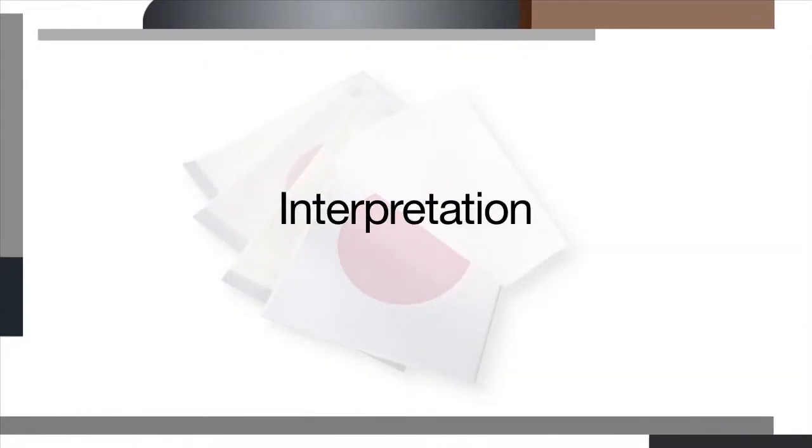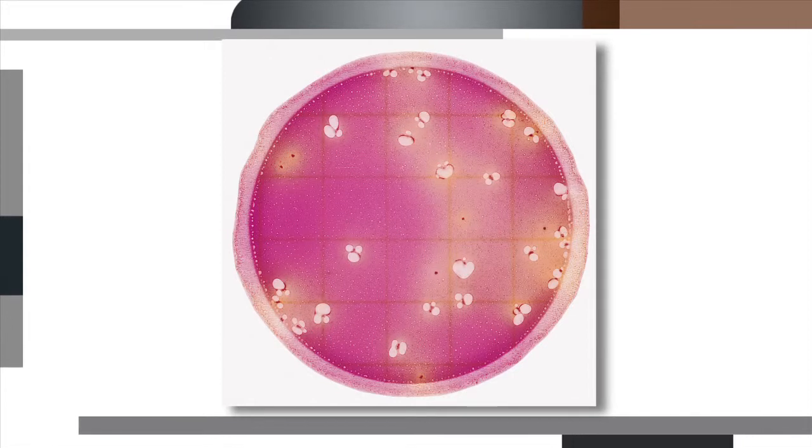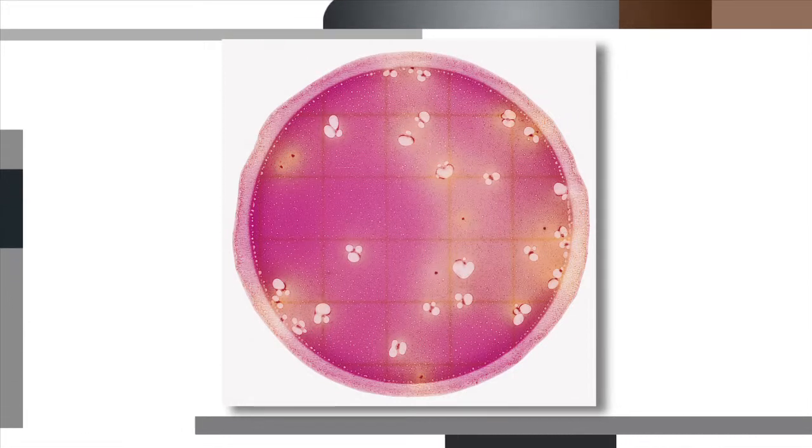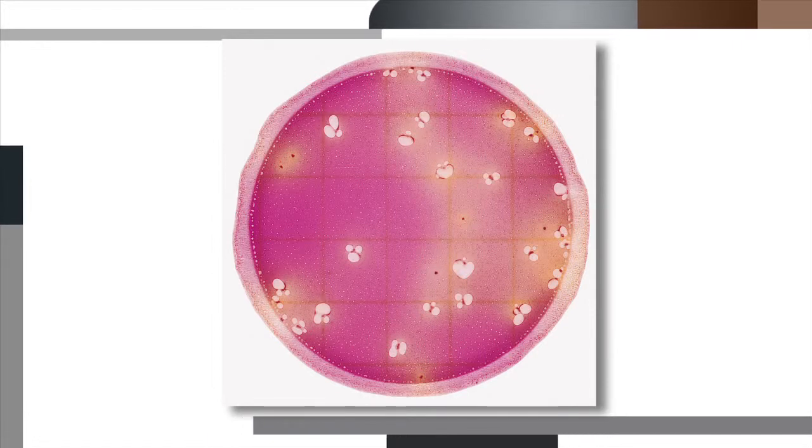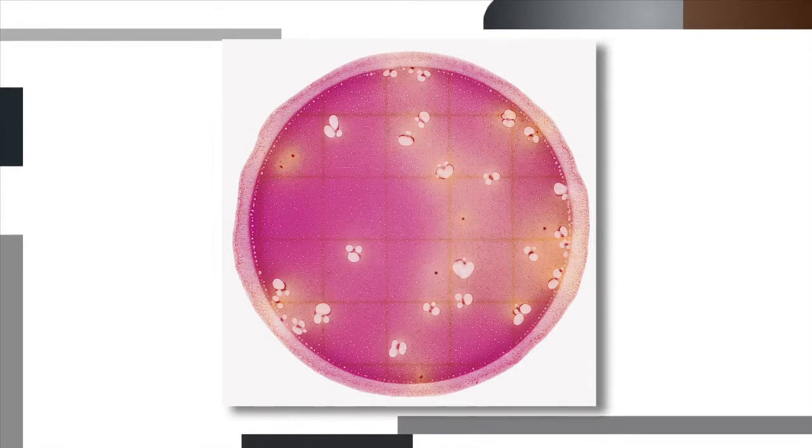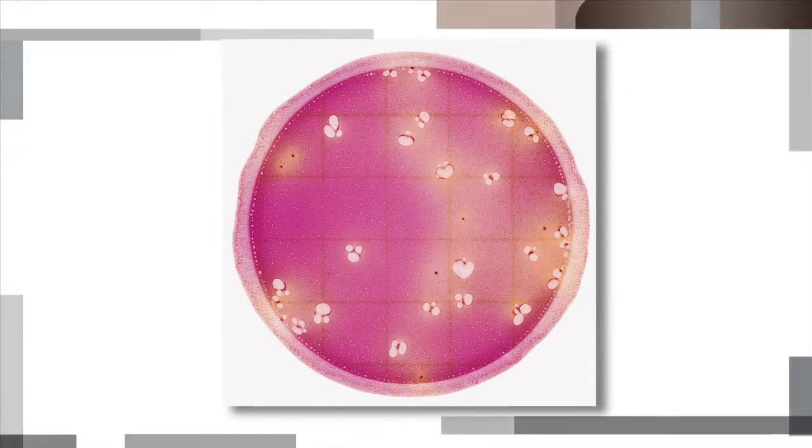The next step in microbial testing is interpretation. 3M PetriFilm Enterobacteriaceae count plates have indicators to assist you in interpreting the plate. An indicator dye in the plate colors the colonies red. The top film traps gas produced by some bacteria and the pH indicator detects acid production.